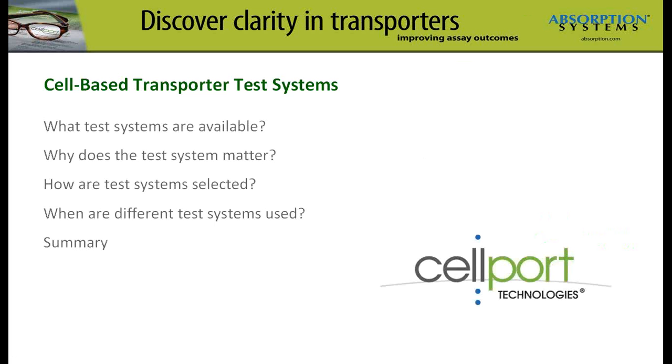With the introduction of new draft guidance by US FDA, people have realized the importance of in vitro systems to differentiate the drug-drug interaction. Therefore, people have heavily relied on the interpretation of the in vitro results of the compounds of interest. There are many systems available through the different CROs and pharmaceutical companies.